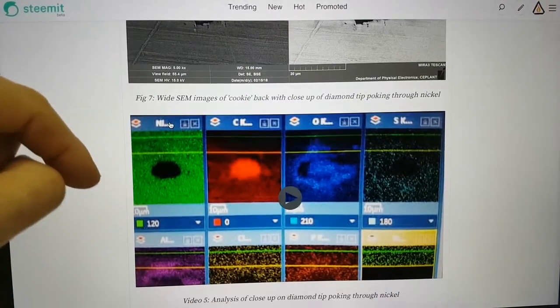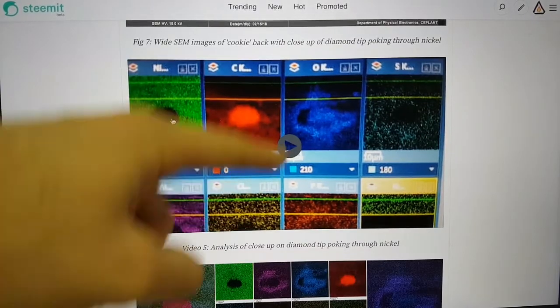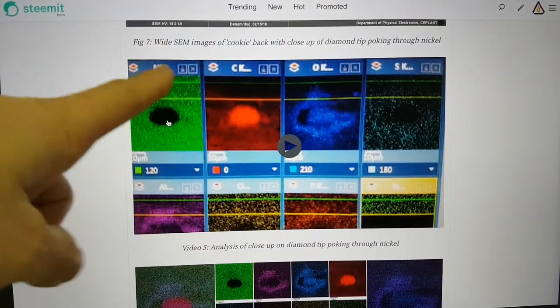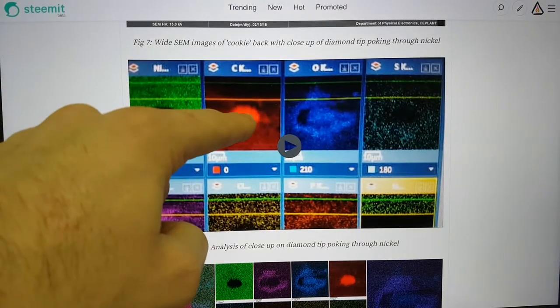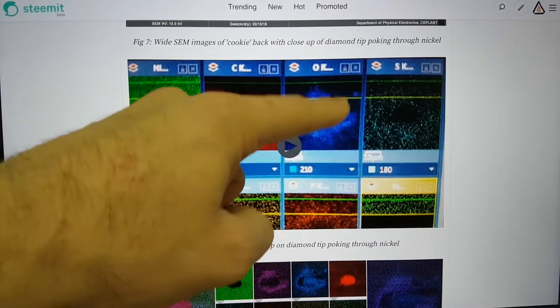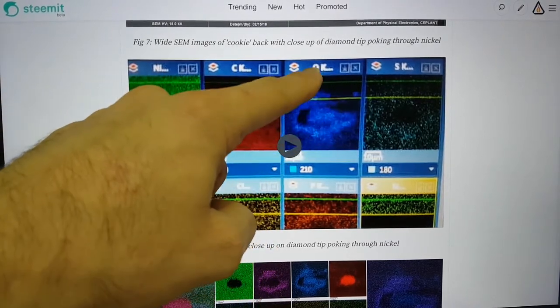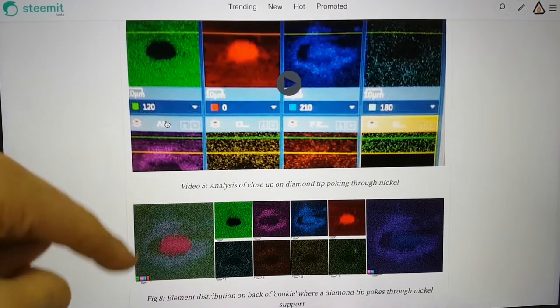This is the backside of the untreated cookie, also looking at where a diamond is poking through the nickel. Actually focusing in on this area, we found something quite interesting. You can see here the nickel in green and the carbon in red.